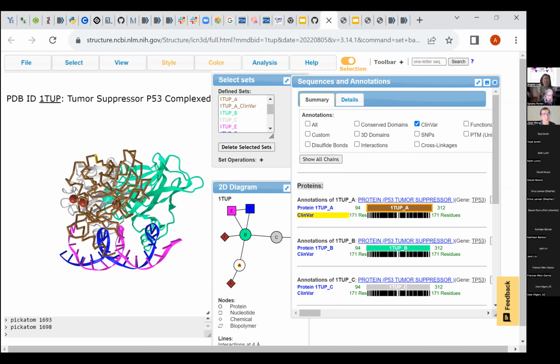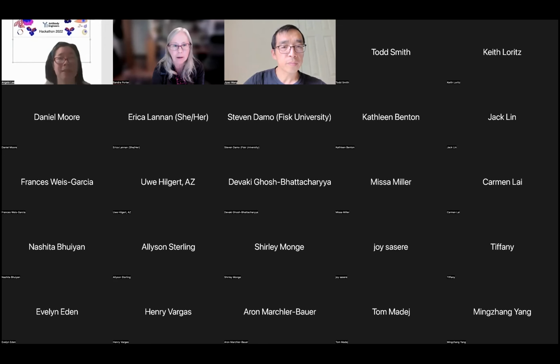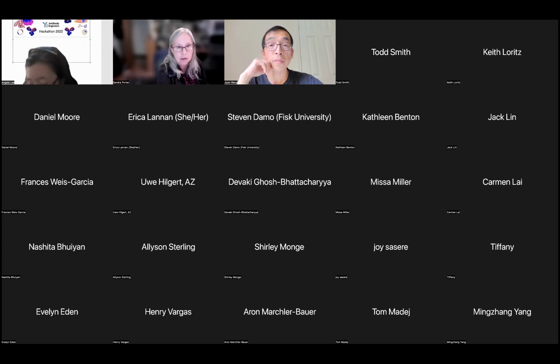Thank you. That was my question. Sandra, there was something we had gone over in our group, the loading data issue. Is that worth mentioning? Yeah, I think it's hanging if I do a BLAST search, Jiyao, but I'll put that into GitHub. I tried to align a sequence to the sequence from a structure, and BLAST was still waiting. So I went back and clicked Smith-Waterman and it worked just fine. So I think it's just a BLAST thing. Okay, thanks.